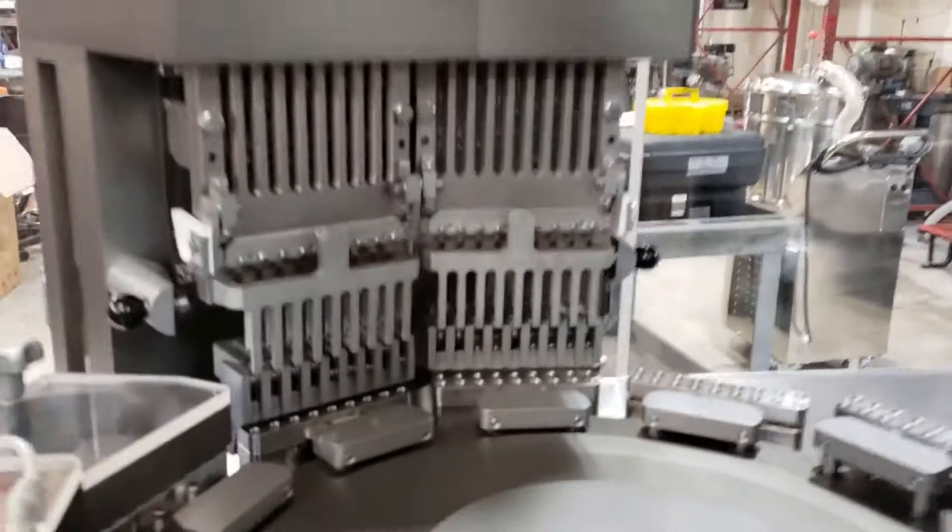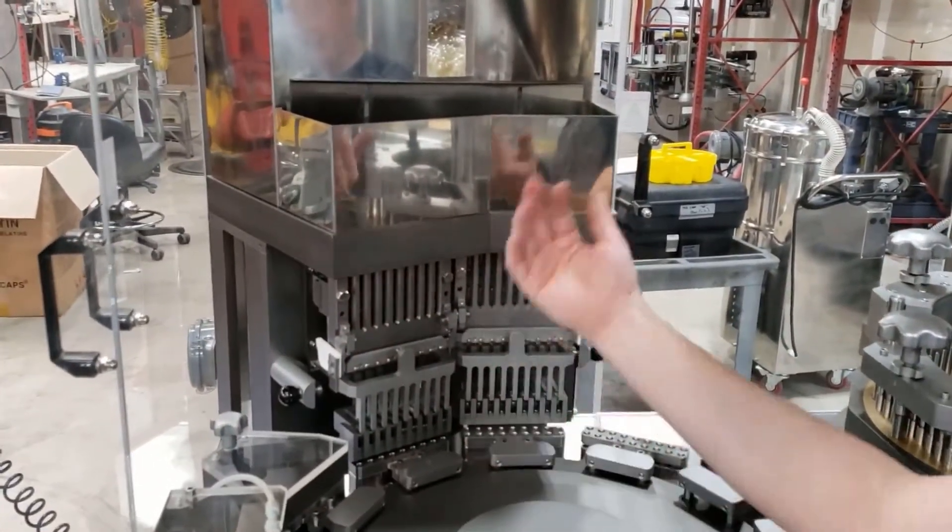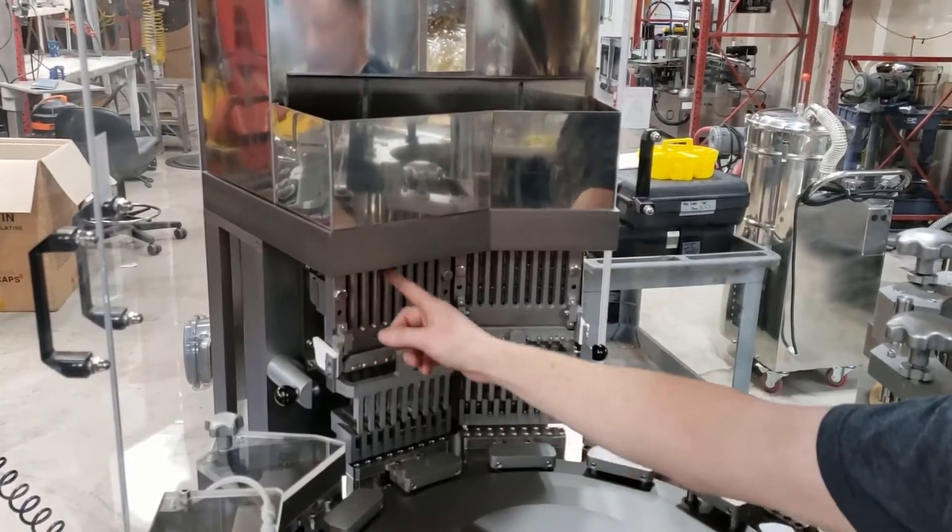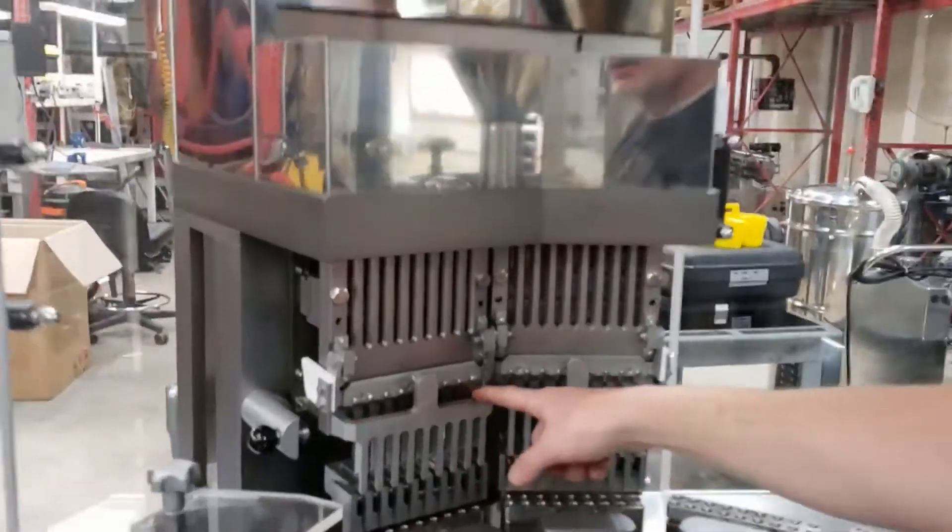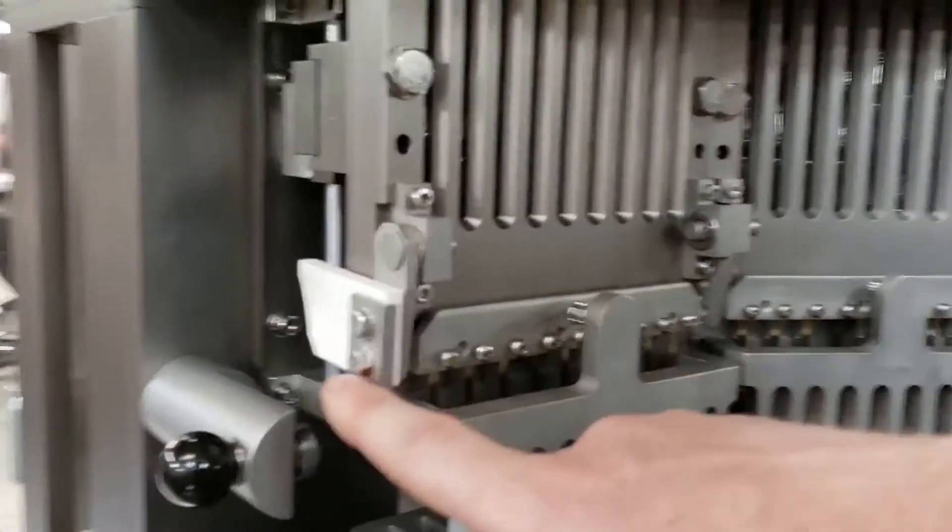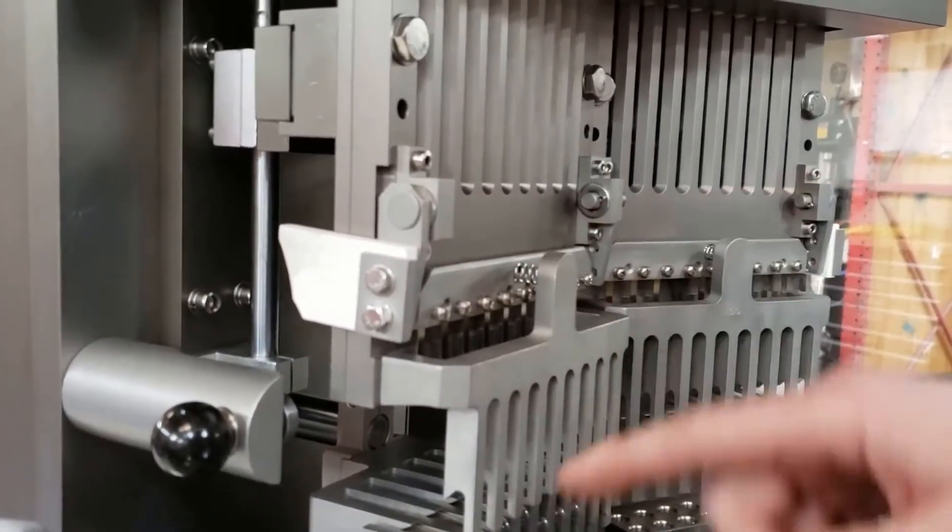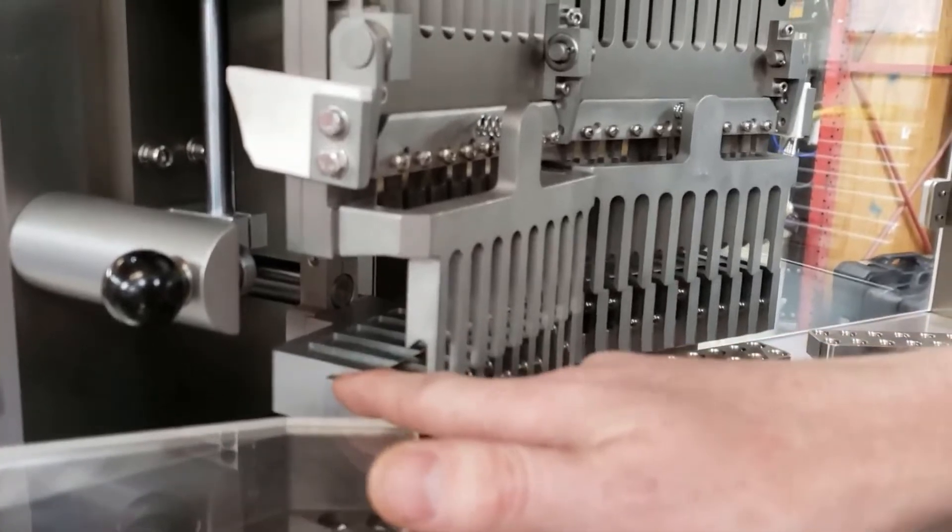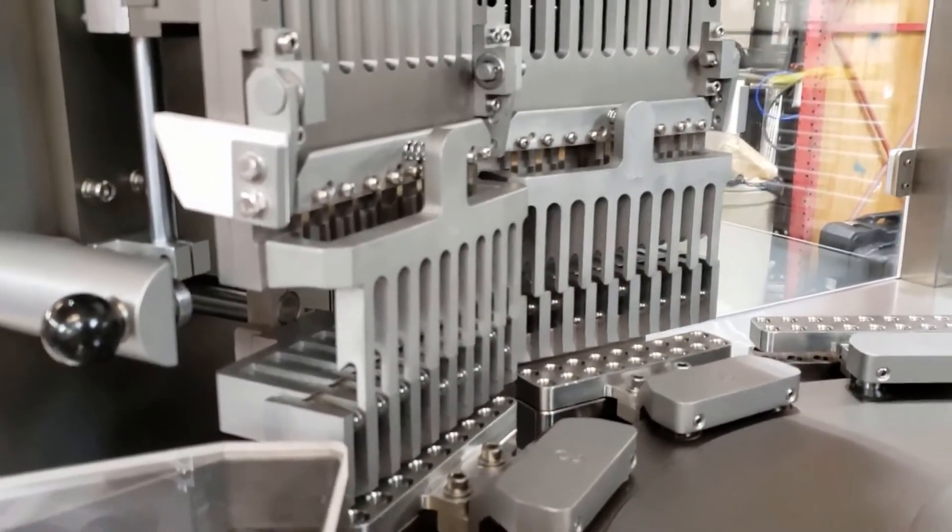So how it works is, these are what we call the magazines. They're going to reciprocate up and down and the capsules are going to fall down these channels. You can see down here we have little clips that are going to stop them from continuing to fall. But as these magazines come down, they're going to hit the trip cam here. That gate right here is going to open up and it's going to release a capsule down into our sorting block here.